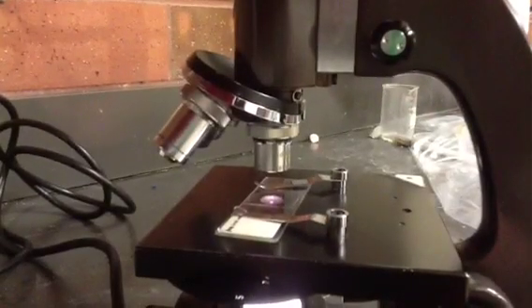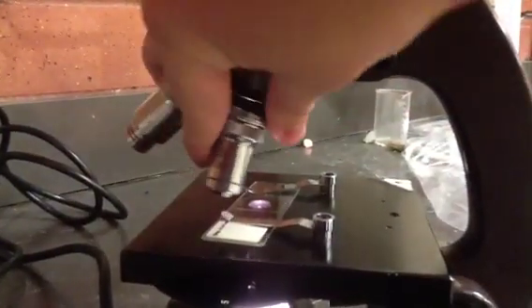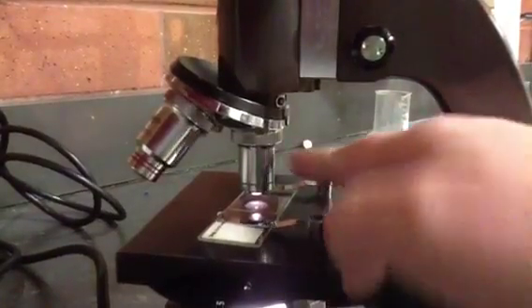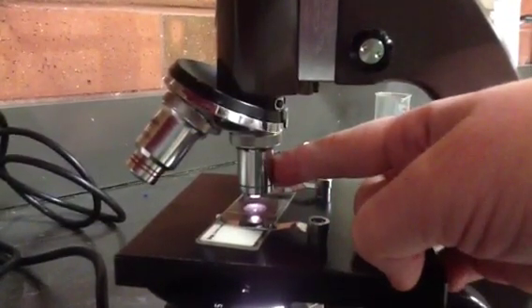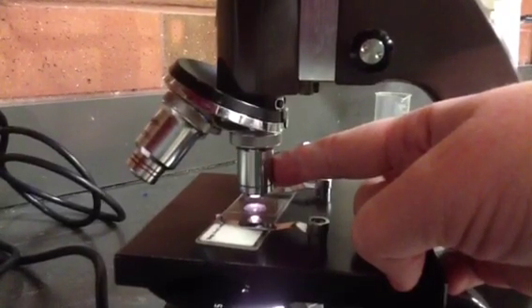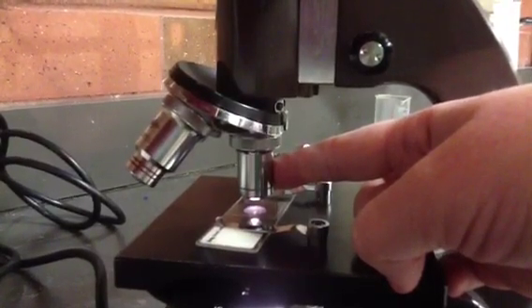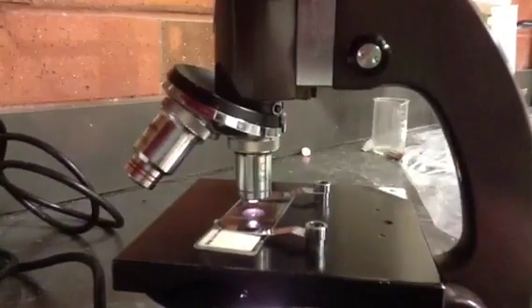Once you've gotten your microscope focused on the low power, you can adjust it to the medium. Rotate the objective lenses into place so that the medium power points down. This one is magnifying your sample 10 times. You multiply that by the 10 times that's in the ocular lens. That gives you a total of 100 times magnification.